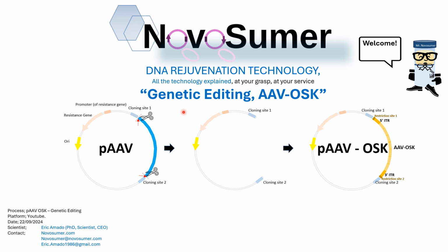Welcome to another session in this gene therapy course. And today's topic is genetic editing. We are going to use text editors to edit DNA. Okay? And today what we are going to see is how to use these text editors to edit this DNA.